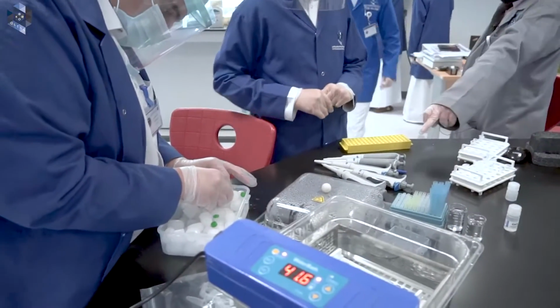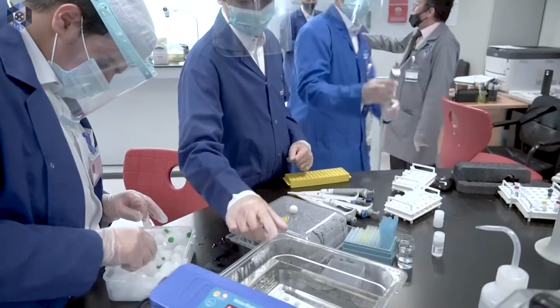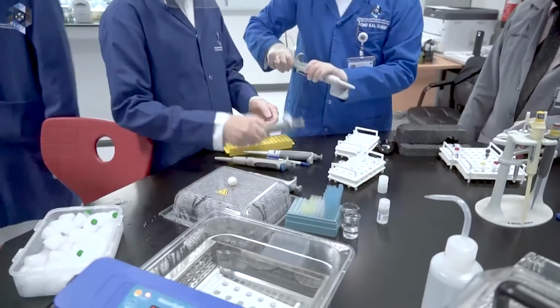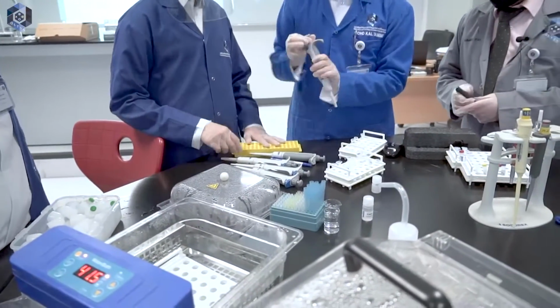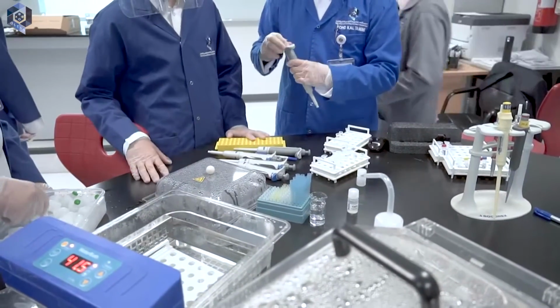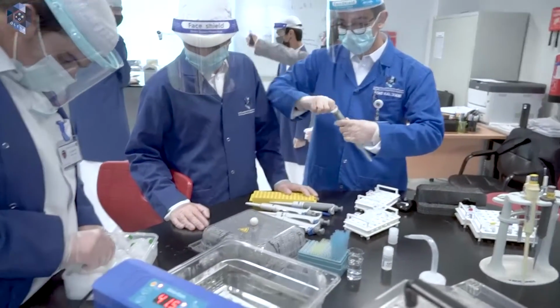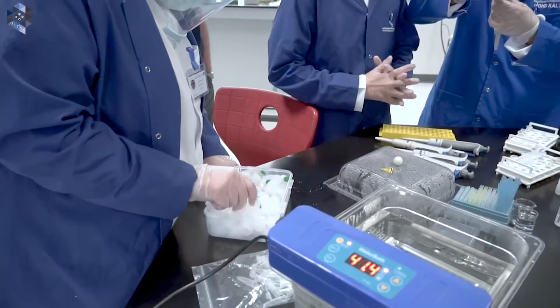Prepare the micropipette for 250 microliter. Quickly, now bring the sterile pipettes, the sterile tips. Bring them here. No, not this one. These are okay. We will be using them. Now we will be using the sterile ones.